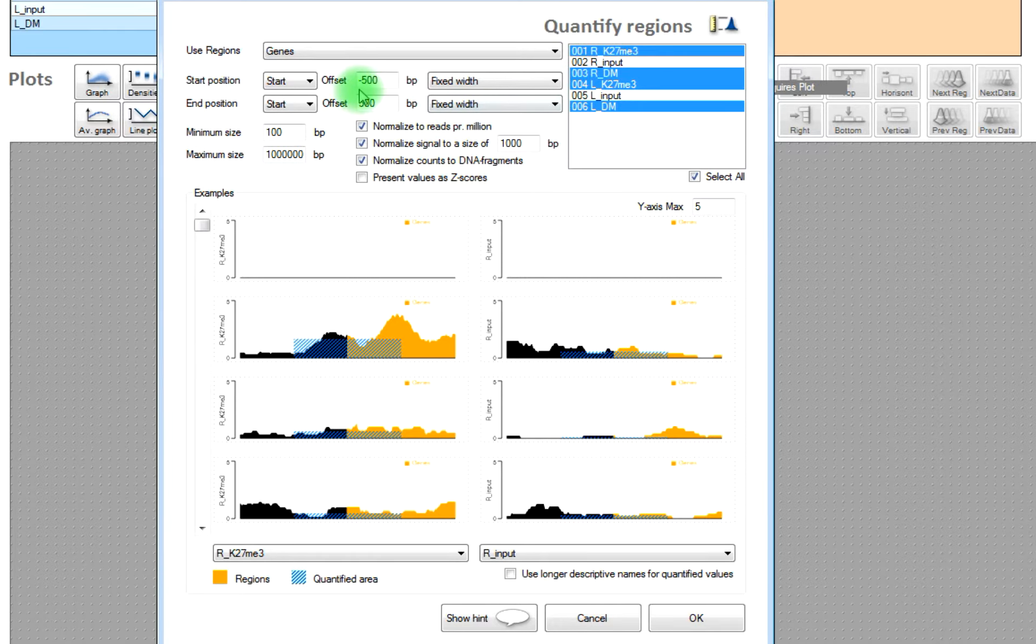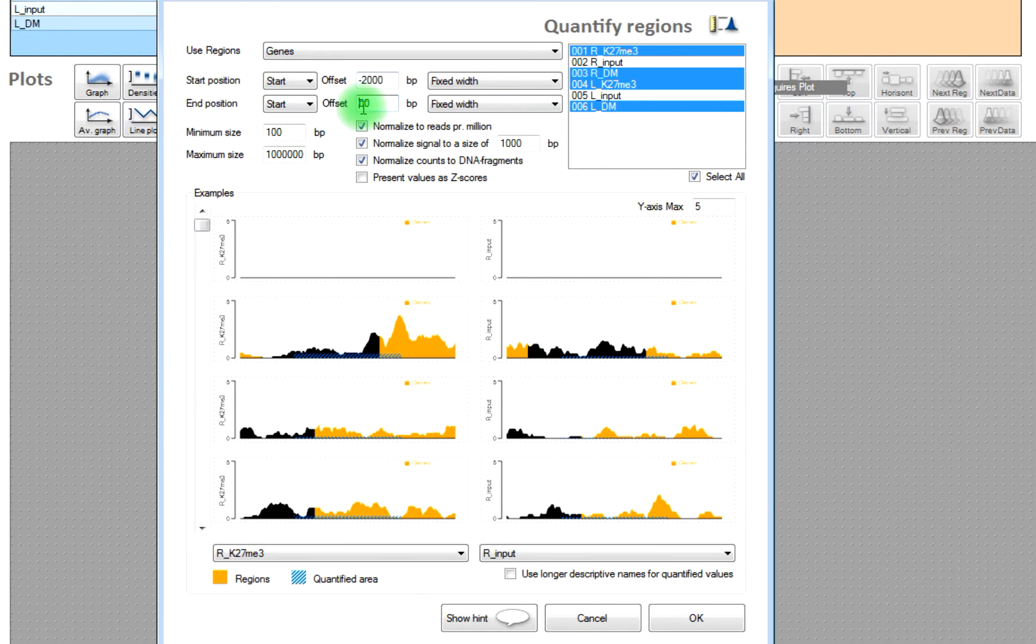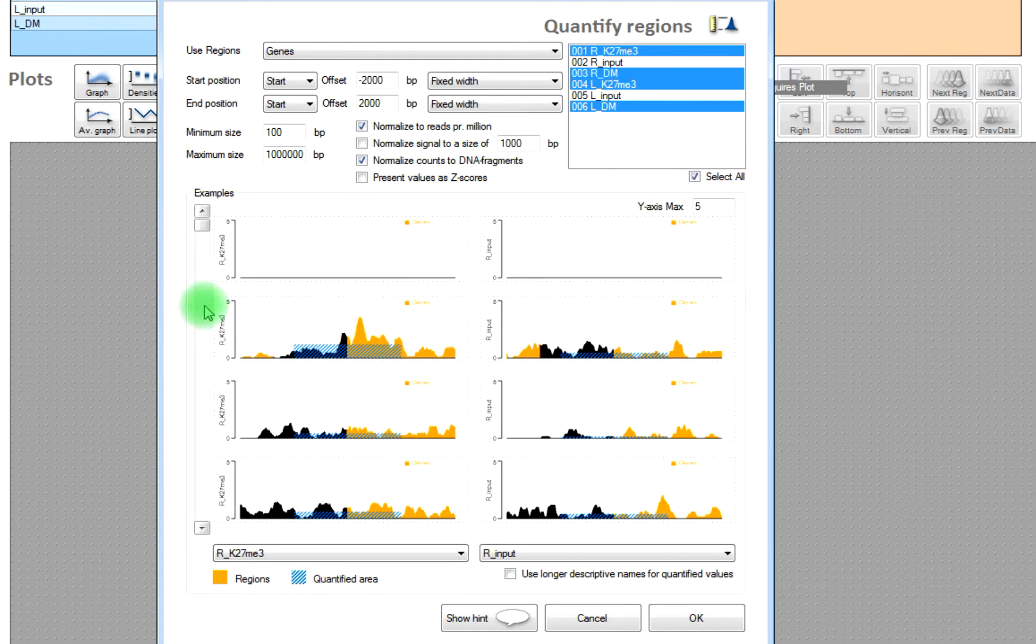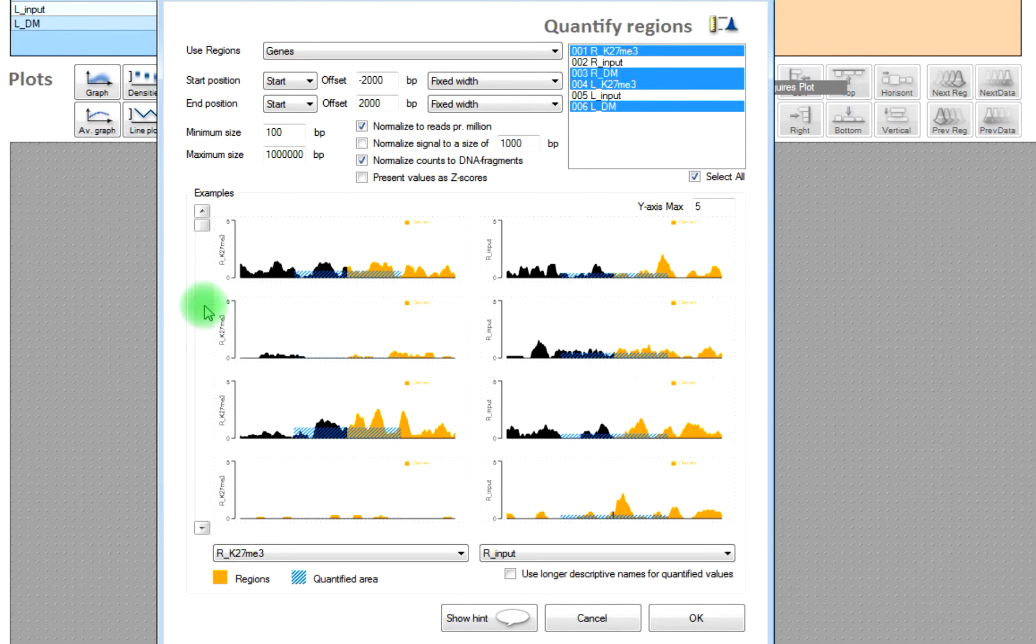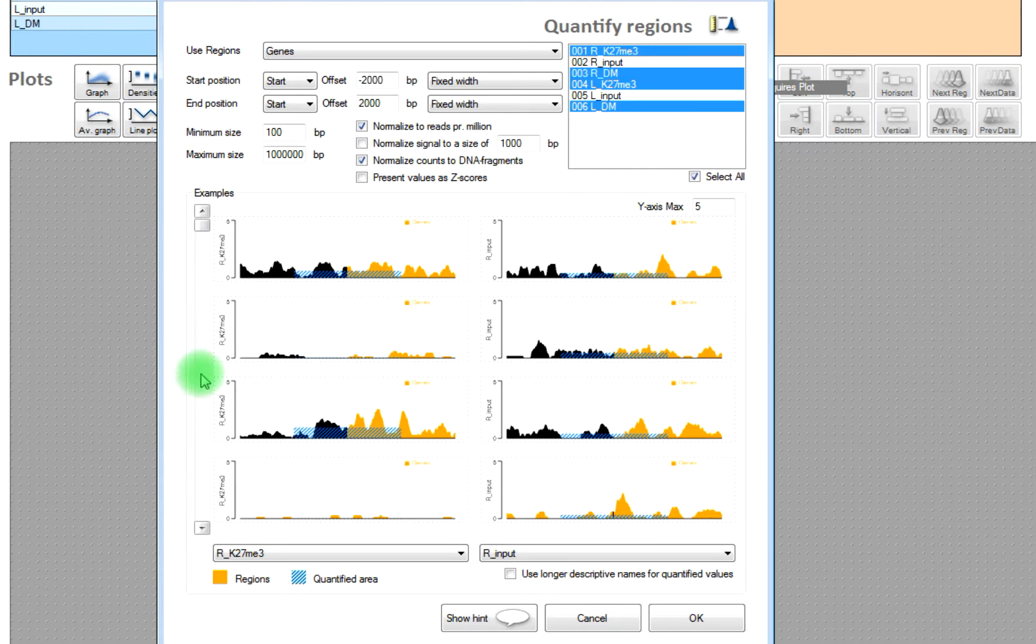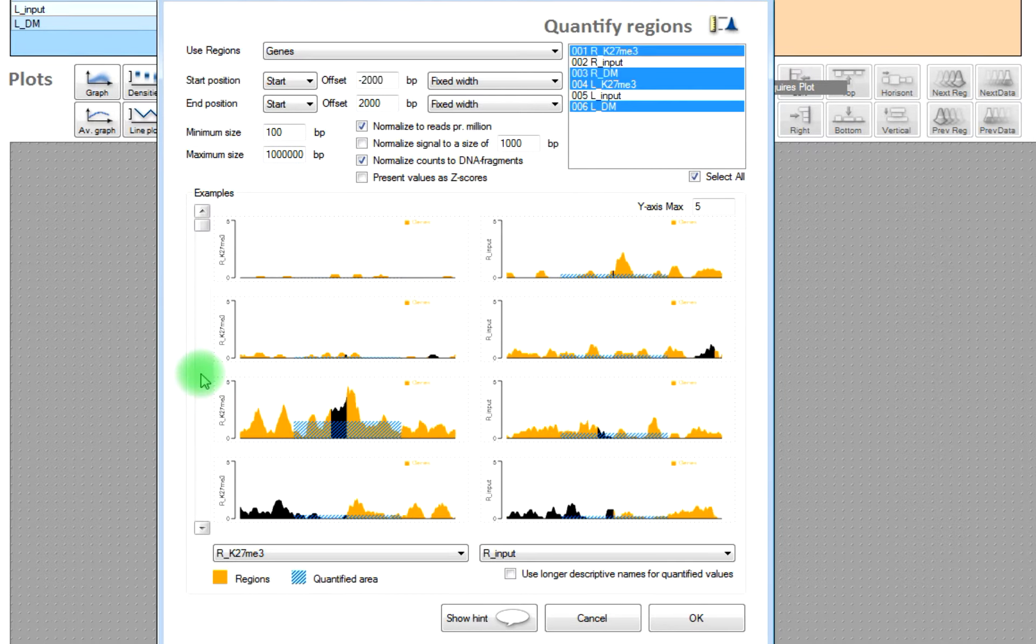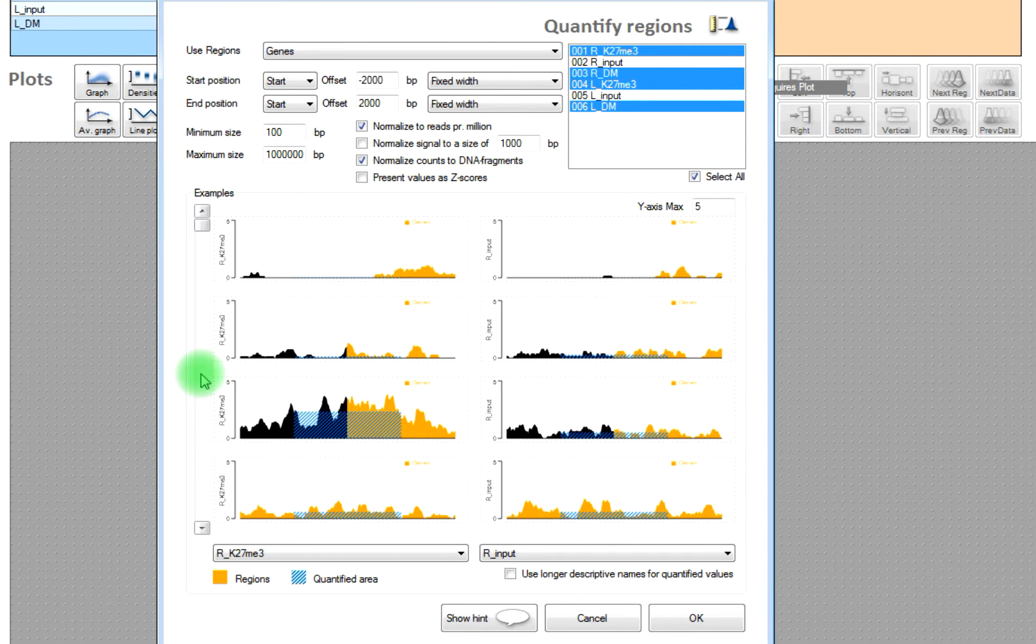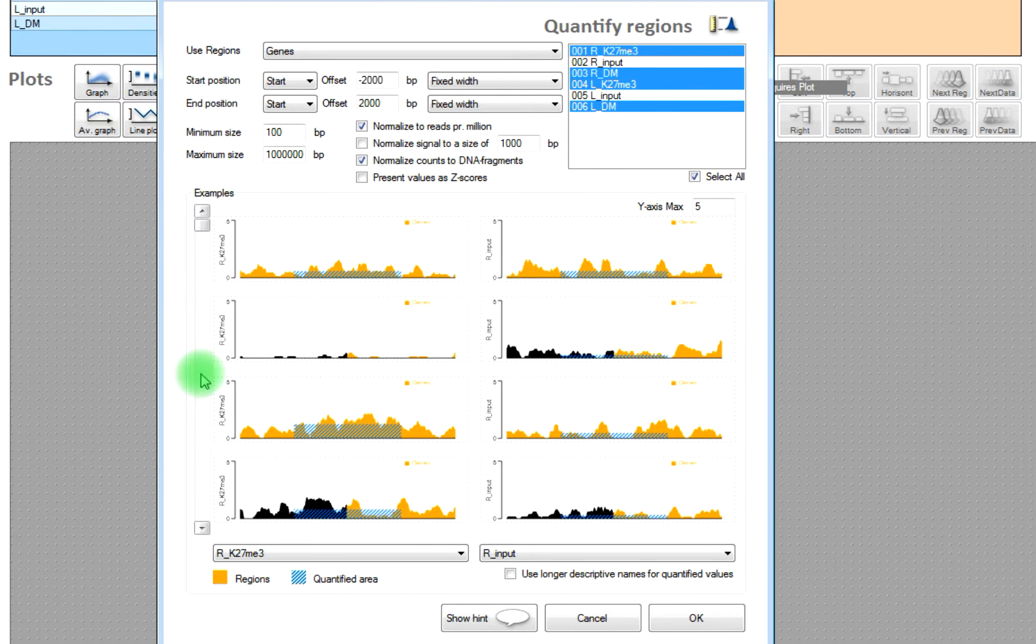And we will also select to quantify from four different samples and then we will specify what window we should quantify from. You can see the quantified values as a blue squared area, and then you can assess whether you're covering the area you would like to well enough.